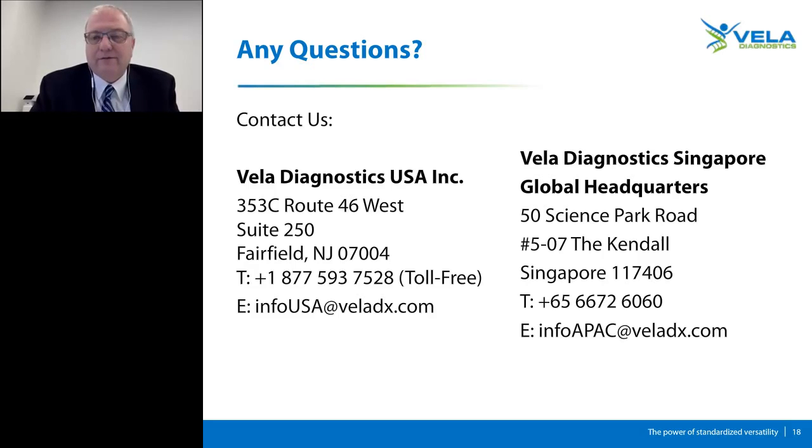Although the guidelines today may show higher mutant allele frequencies as being clinically relevant, we also have been working with collaborators who tell us that we should be driving those mutant allele frequencies as low as possible because they are seeing clinical relevance of those in many of their patients today.